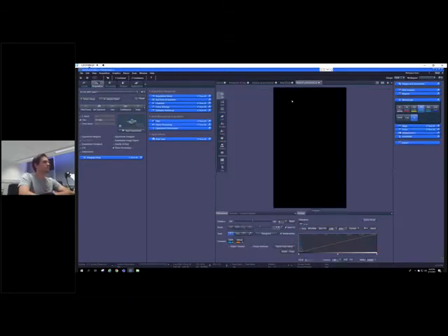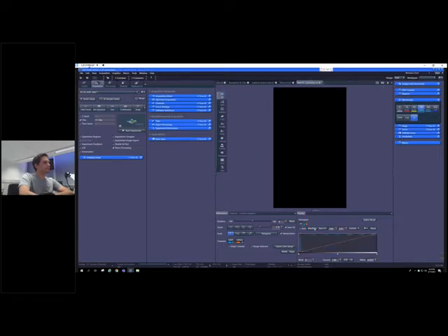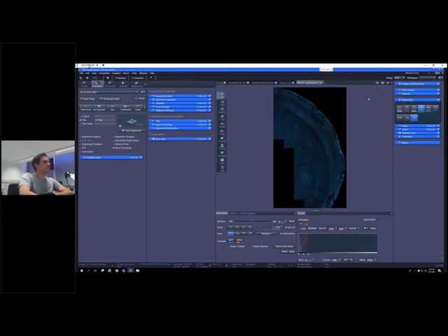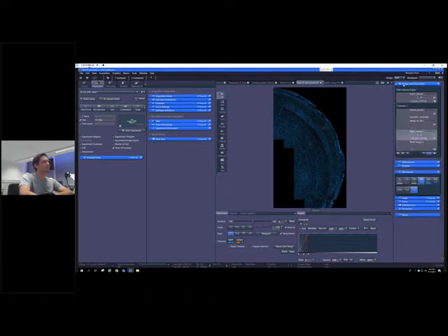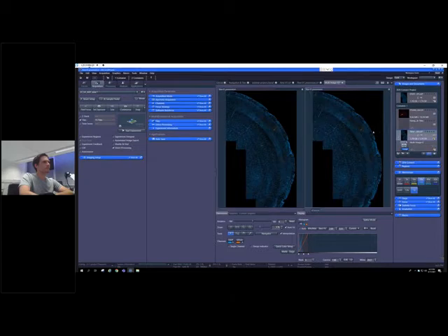All right, so here we go with our tile scan. And as promised, we directly get a processed image, which is then our deblurred image. Let me just put this side next to each other, and let me show you how this is looking like.